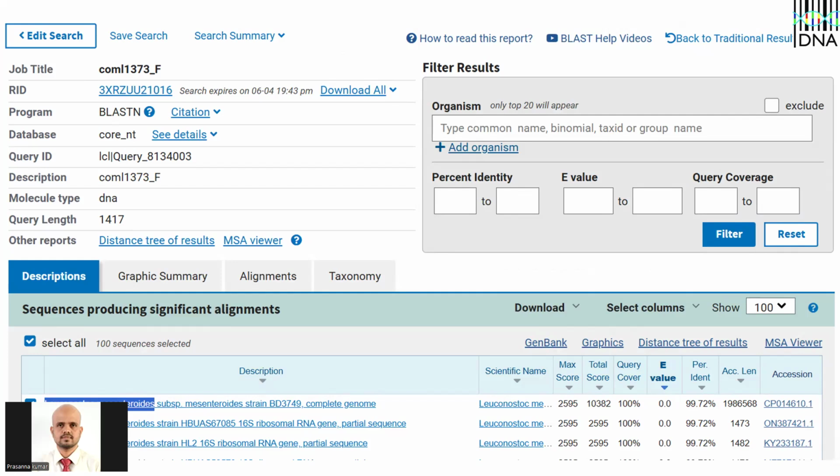So this is the first cue you should know that you may be working with a new species or novel species. We have other assays like DNA-DNA hybridization and whole genome sequencing to verify new species. Then you can propose your own species name, because it's a new species. That's how discovery of new species is done. And BLAST is the first window that gives you a glance at whether your strain is new or not.